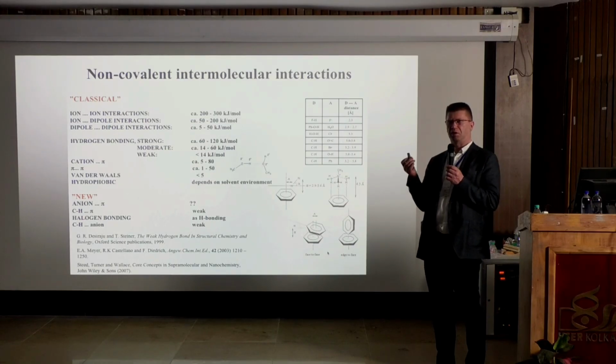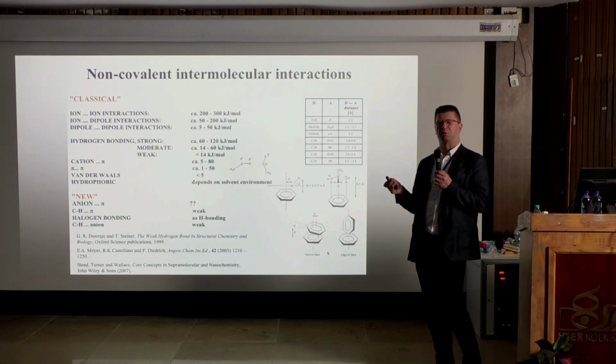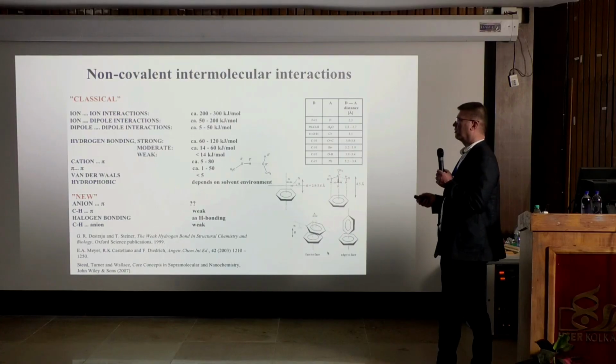So the information of the X-ray structure, like my colleague said yesterday, you can find a lot of things inside the structure which can explain the behavior. For example, synthesis, other things. It can also, in some cases, give an indication or hint to solid state properties, and all these kind of things. So the molecules pack in a certain way, they are photoactive, for example. So that is the very important part.